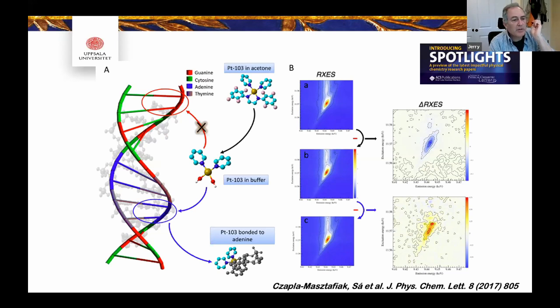And so that got me thinking, you know, you can get something that looks an awful lot like HERFD if you do a maximum likelihood deconvolution on your XANES. Okay. And so I was curious if you had tried that. We've played with that a bit in the past with lanthanides and other elements where the core hole broadening is very large. Yeah, we didn't.